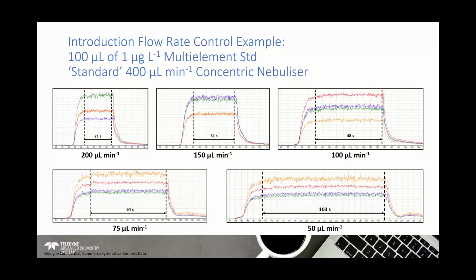So what I want to finish on this particular slide with is that you can really start to make the most of low volumes. And that will give you a lot of advantages in terms of things like sample preparation. So you might be interested in a large analyte suite, and this will help you get more measurement out of a small volume for a large analyte suite. But you might be interested in other things as well, such as analytical precision, which I'll get to.